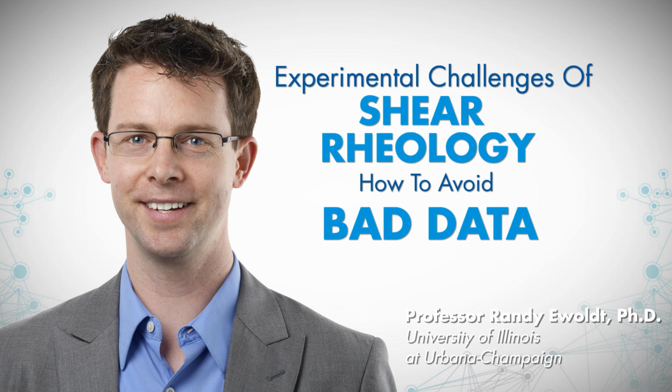We asked those same questions as we were preparing that work that has been published in the Journal of Rheology. I don't know if I cite much of that in the slides, but it's in the book chapter cited, and we give it some very detailed treatment. To address both of those: if the surface tension were different, you actually change two things. The lower surface tension means that all of the surface tension forces are, of course, smaller, but you also change the contact angle. A lot of times with a lower surface tension, you'll have a lower contact angle, and things will tend to be a little bit more wetting. Both of those effects come into play. In general, yes, as the surface tension is lower and it's more wetting on the geometry, it will tend to be better.